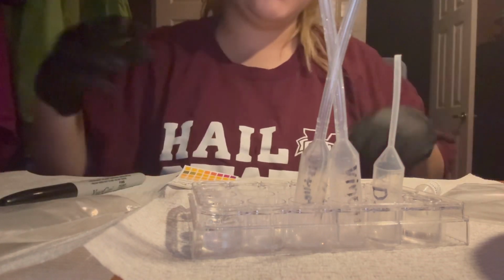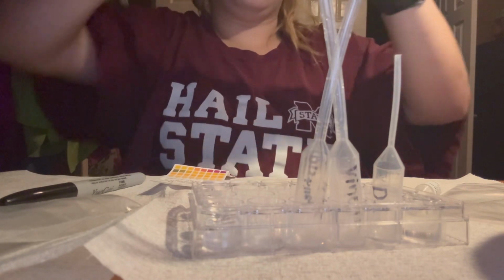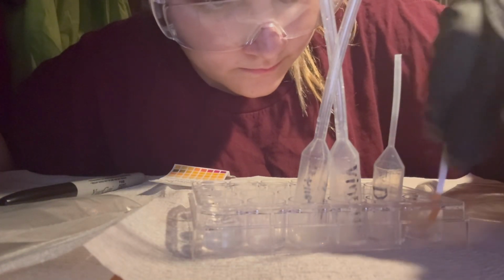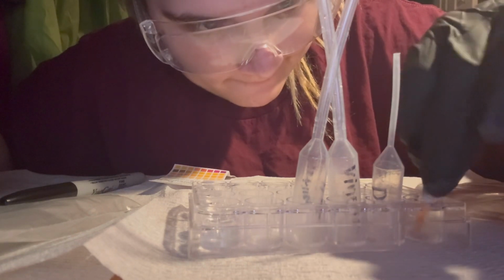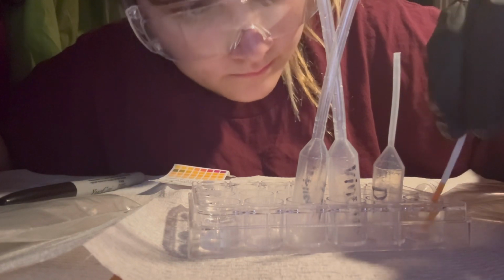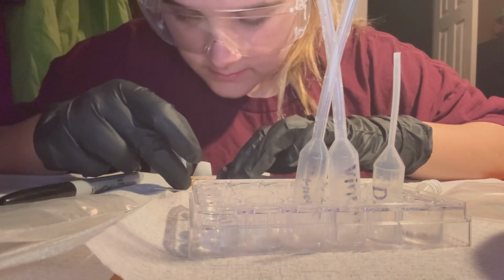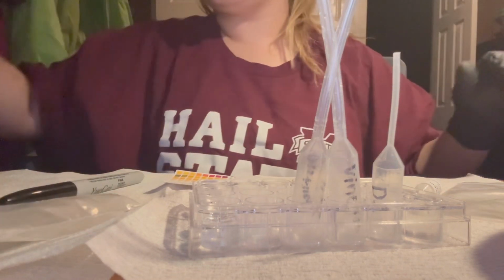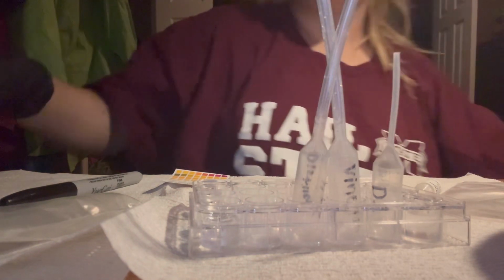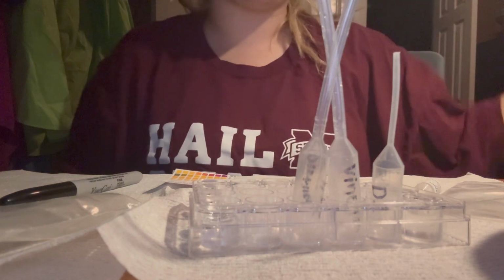And okay, now we measure it again using an unused pH strip. The pH seems to have gone up a little bit. So I'll probably put it at around 4.5. Alright. We do this until we get all the way to 16 drops, and I'll show y'all the results.